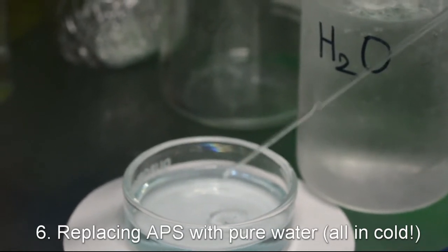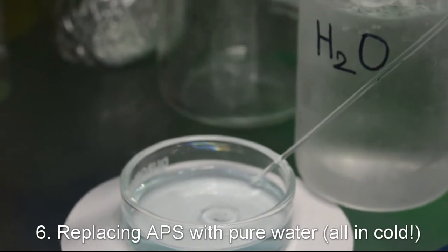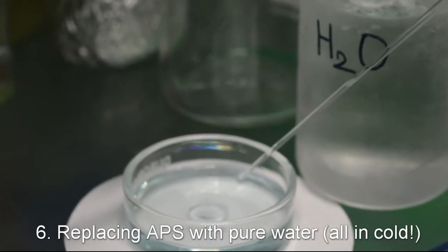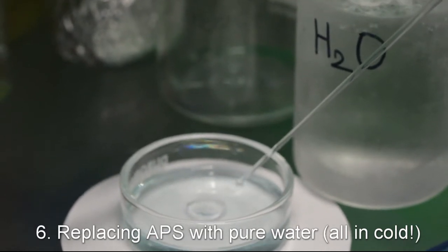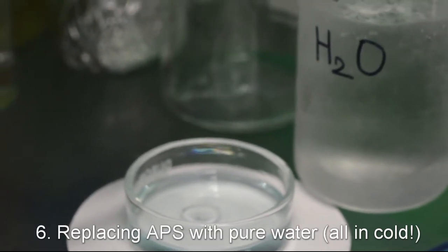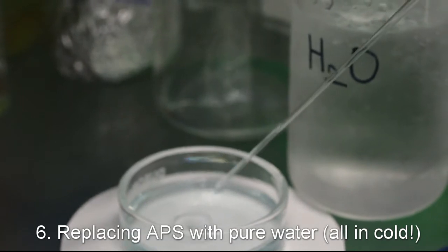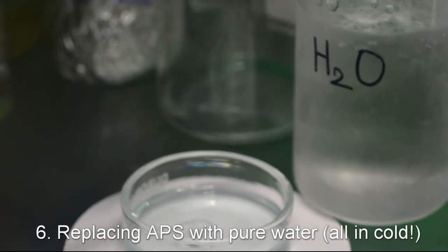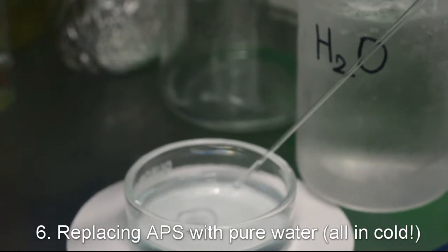Having very cold water is critically important here, otherwise cyclohexane will melt. We do it in the simplest possible manner, manually, slowly removing the APS solution and adding pure water. You can do it in a smarter way with a pump, for example, as long as you make sure that everything stays cold.